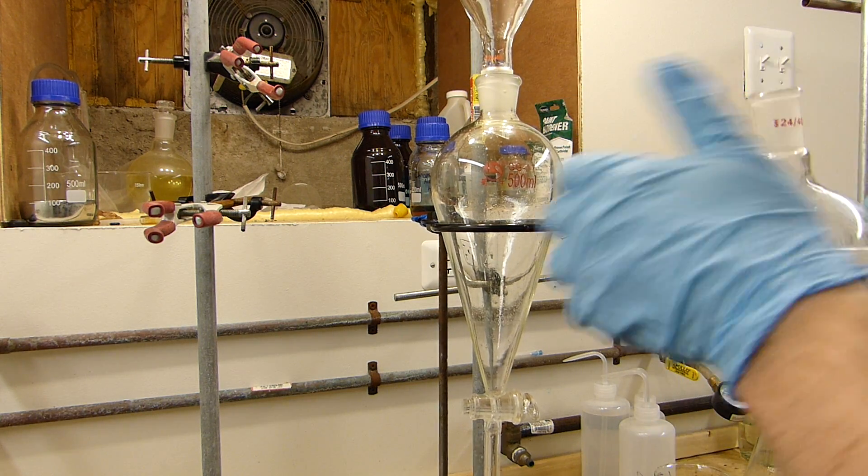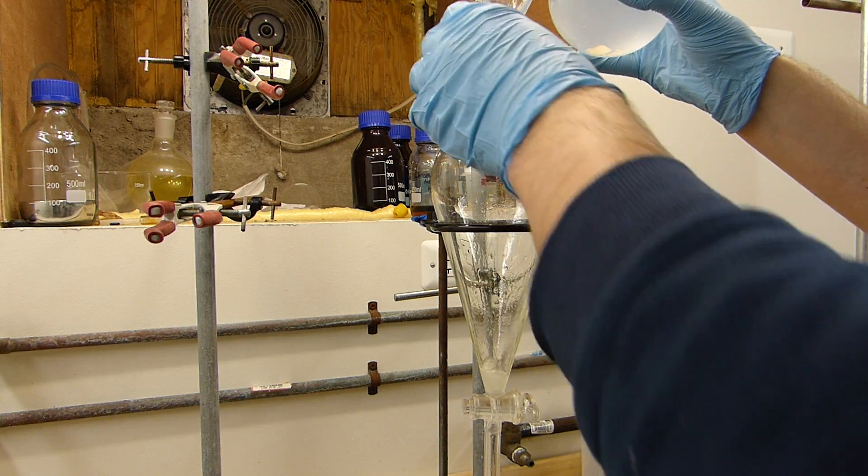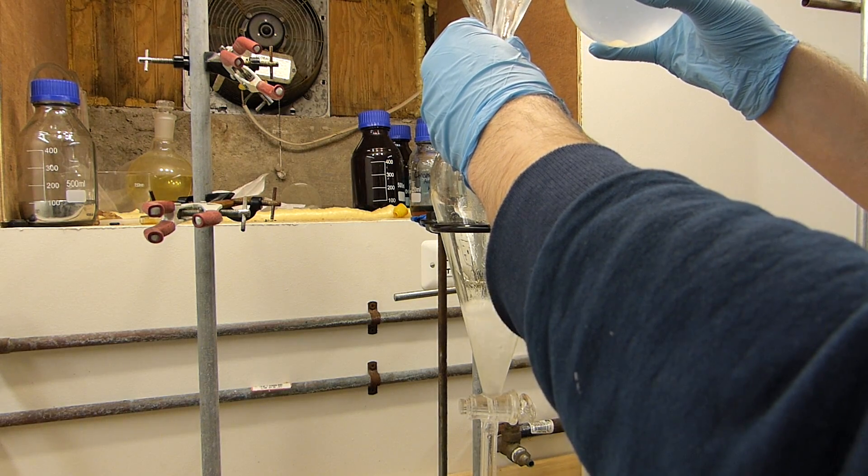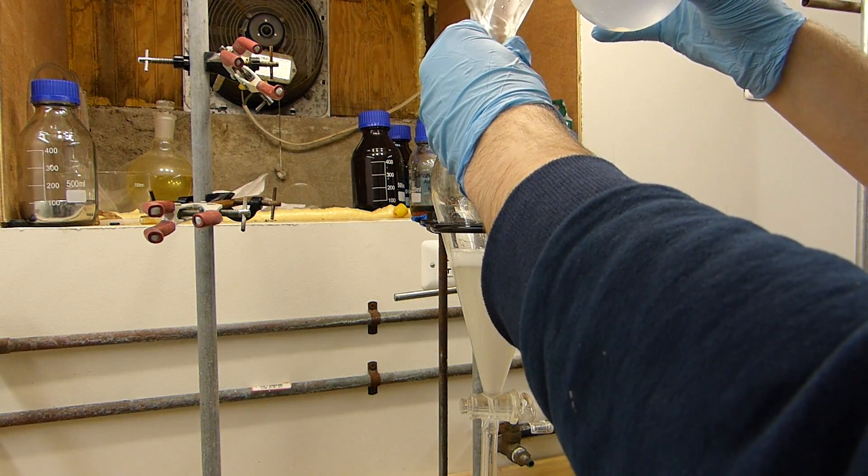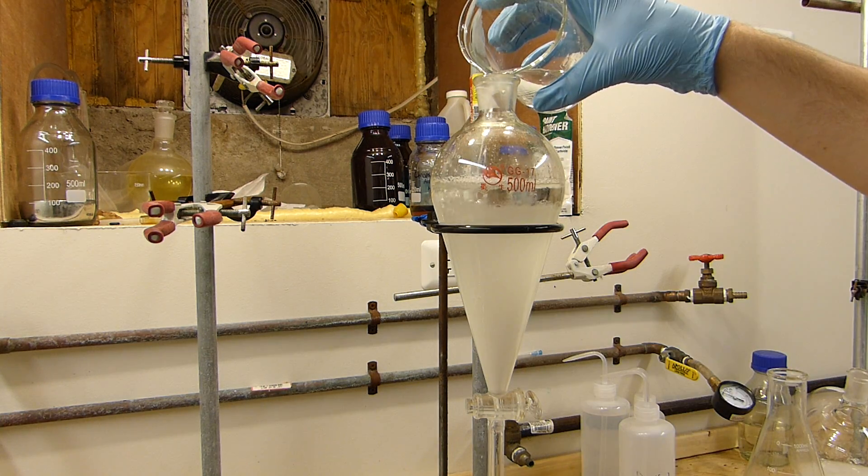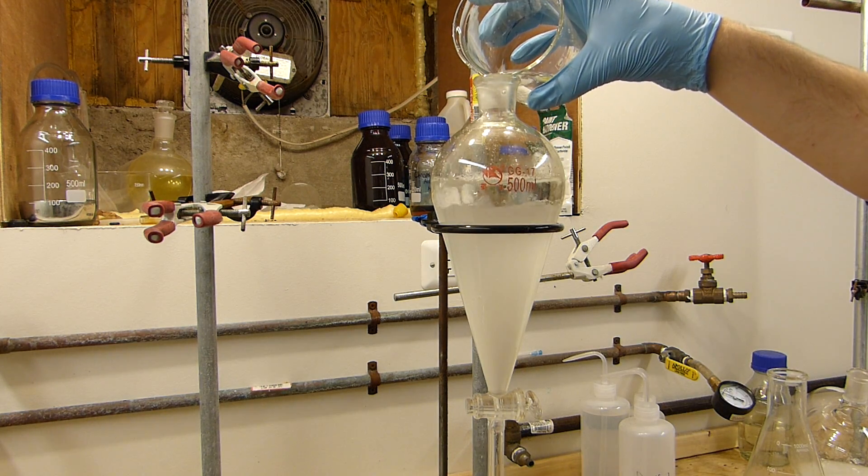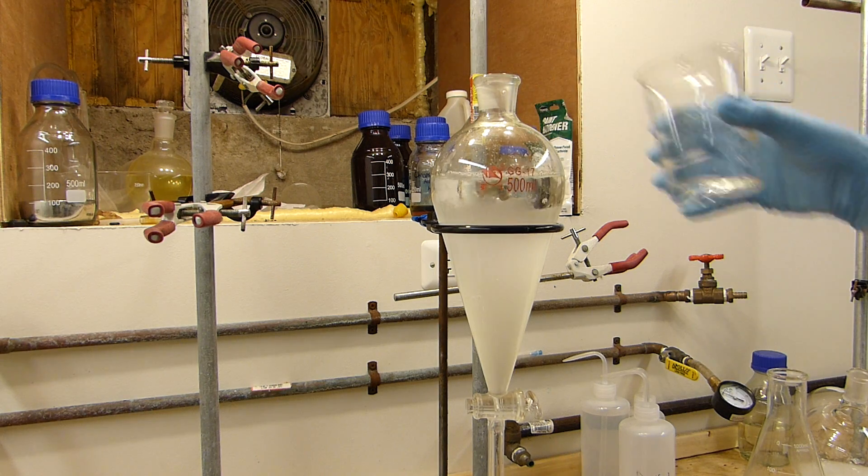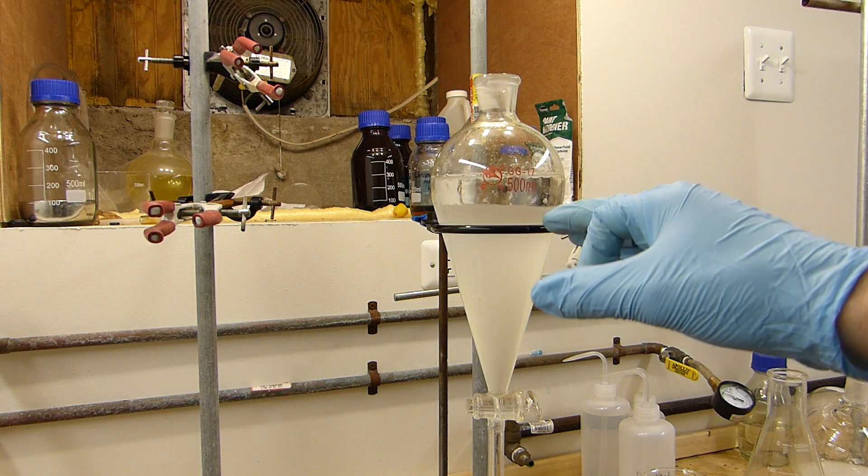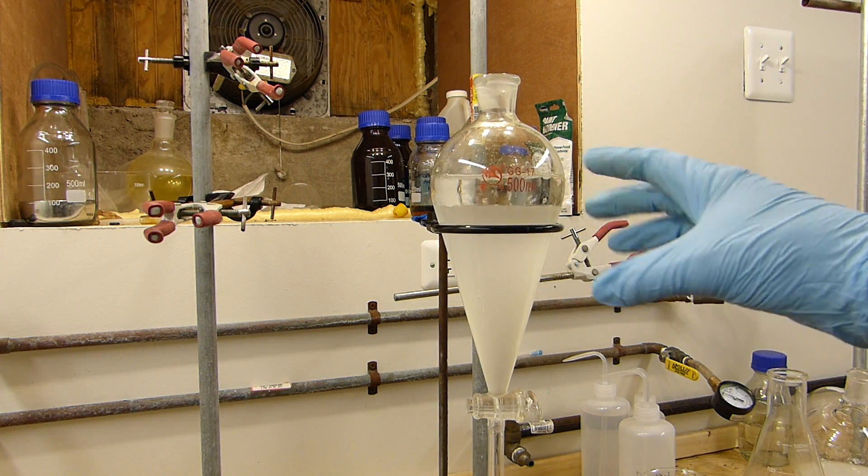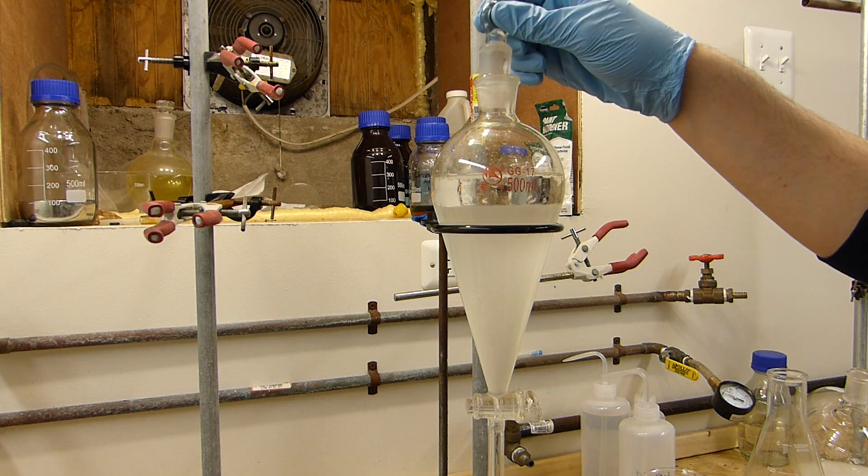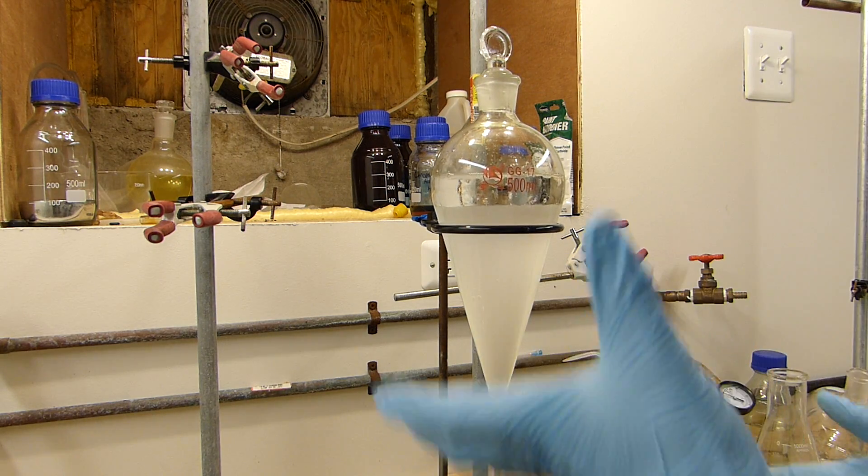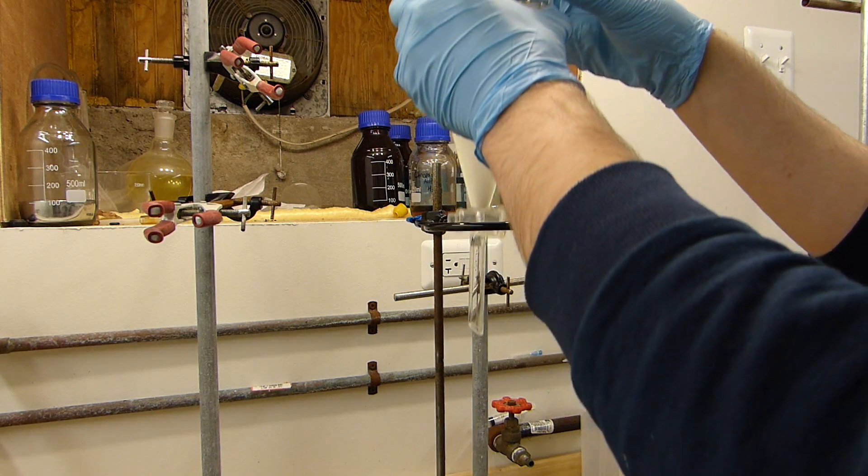And now to add the dichloromethane back to the funnel, first making sure the stopcock is closed, and I'm just going to repeat this process two more times. You can see that the second time the water layer separates out much more quickly, which indicates that this layer is now extremely hydrophobic and that's because we've washed most of the methanol off in the first washing. But this and one additional washing should separate it nearly completely.